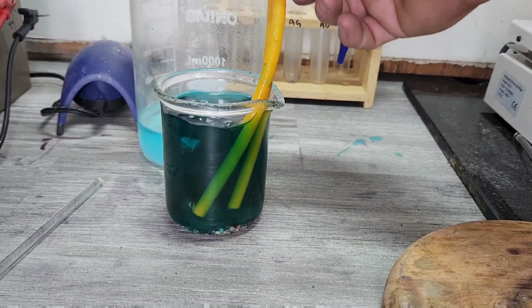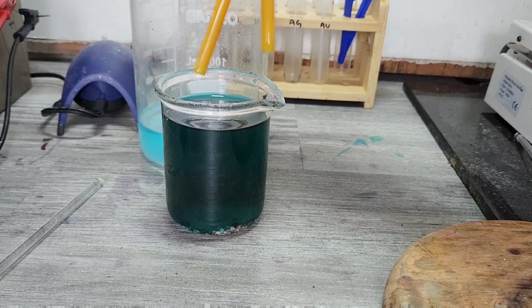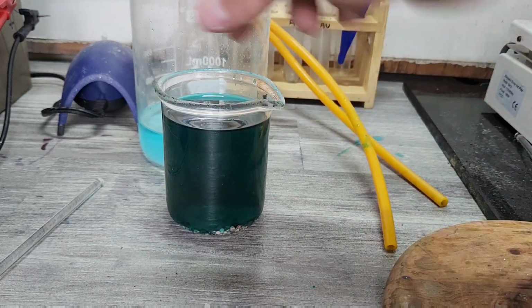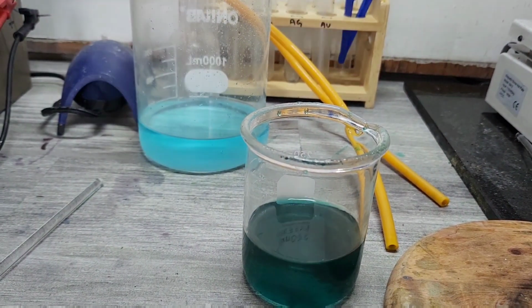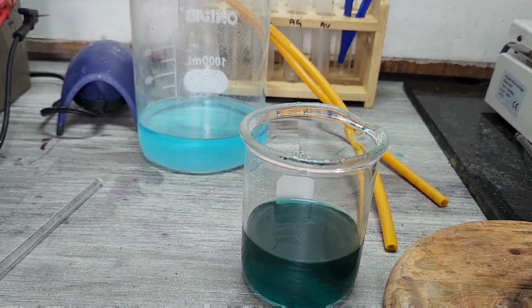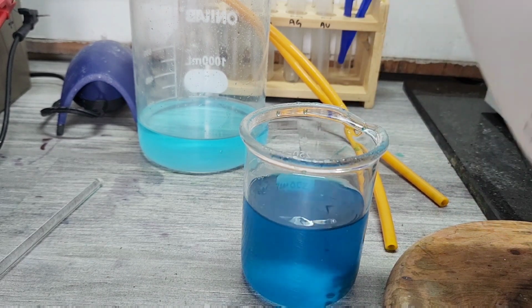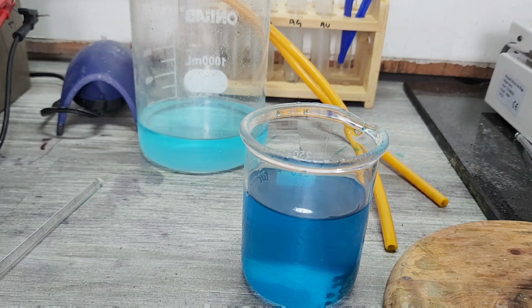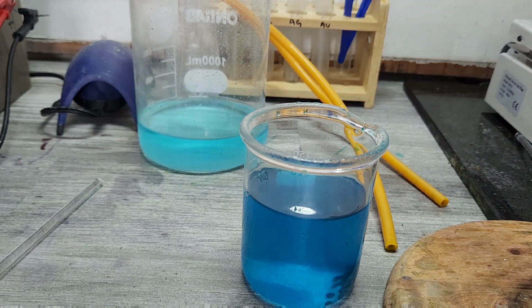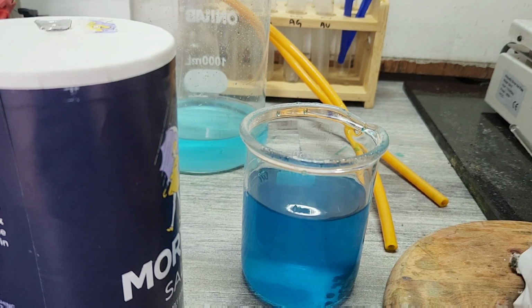Alright, so I think I'm gonna top this up with a little more hydrogen peroxide. So I'm gonna go in and dump some of this out in the beaker and make some room and then fill back up. Might have poured a little too much solution out. We're going to do a top off quick. Not a whole lot.